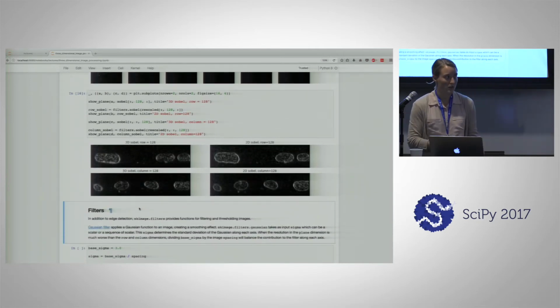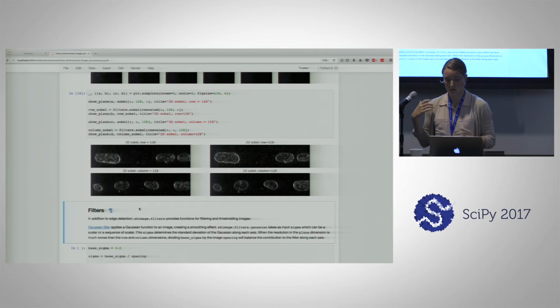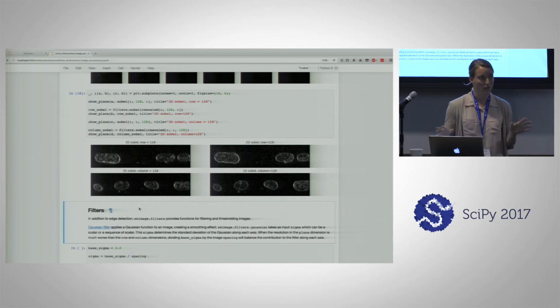In this next pane, however, we're comparing the difference between the operation applied plane-wise to approximate the 3D result and what the actual operation looks like applied to that particular plane. On the left is the 3D image operation, and on the right is Sobel applied to that particular slice. You can get a sense of how in the 3D approximation we weren't able to fully detect all of the edges in the cells in those views. So this is just a careful gotcha, something to consider when you're processing 3D images.